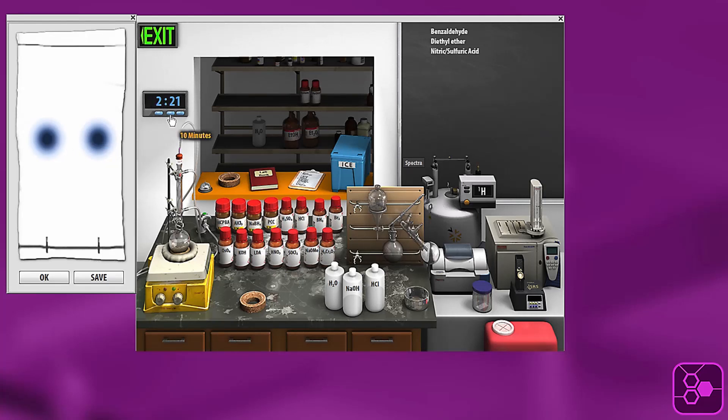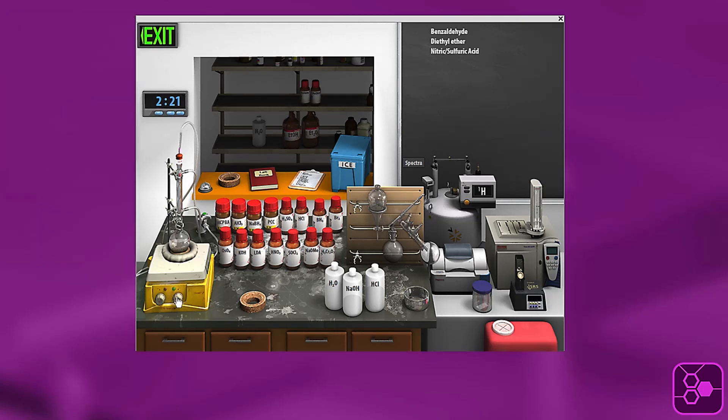You'll notice that as soon as I drag this TLC plate to the flask the time advanced 5 minutes. And so the closest time interval you can do for each of your TLC plates is 5 minutes by default. So I'll close this and we'll begin the reaction.